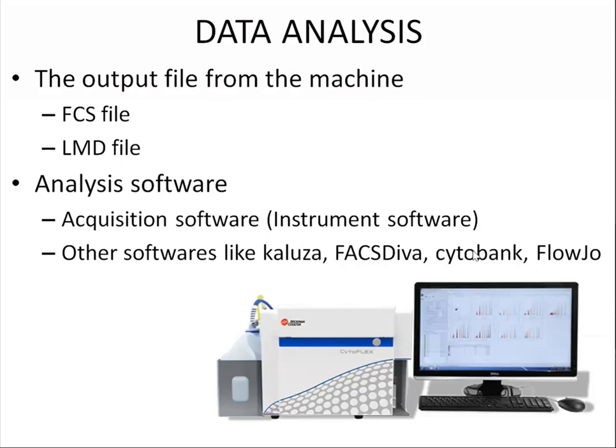What I mean to say is that you cannot use these software to give instructions to the machine. These are all independent software which will be used only for analysis. Or this software will be a third-party software, that is, it is not connected to your instrument or your manufacturer at all.